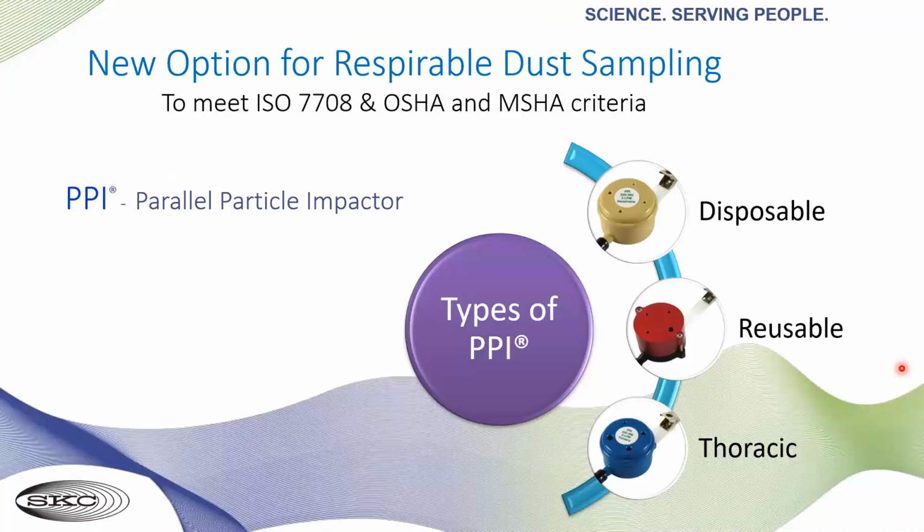All right, finally, the fun part. The newest option and new era of respirable and thoracic particle sampling is the parallel particle impactor, or the PPI. Basically, there are three different categories of PPIs shown here. We have the disposable, we have the reusable, and then we show the thoracic PPI. I will go into each of these during this presentation, but again, primarily the disposable respirable version as it compares to the cyclone.